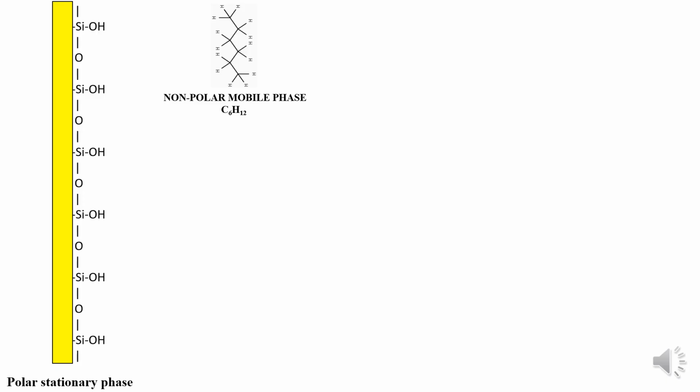Now here we have a non-polar mobile phase, hexane, and a polar stationary phase.